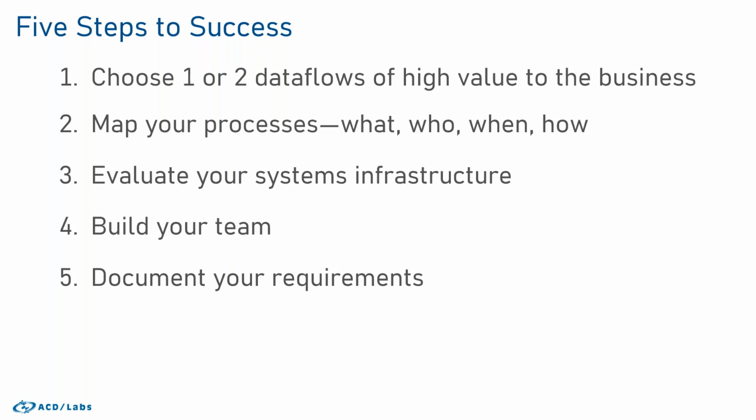So the time interval in terms of when the data is acquired to when the data is viewed and required to be processed, that's something that isn't taken into consideration quite often. But you do need to take that into account, right? Do they need the data 30 seconds after data acquisition? Do they need the data 30 minutes? Do they need the data the day after, right? So taking that into account.